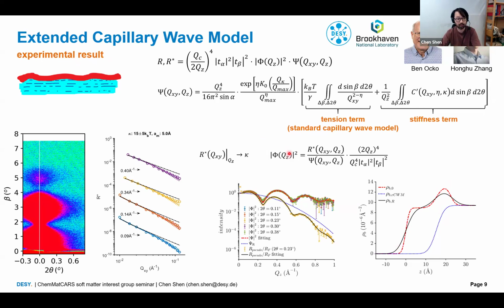And getting this intrinsic structure factor has the advantage that one can now clearly see the hydrocarbon layer and also the phosphorus head group layer from the phospholipid monolayer. So one can really distinguish the two layers much more clearly, and the width of each interface between the slabs directly corresponds to the distribution of the chemical moieties, like this transition from the hydrocarbon region into the phosphorus head group region via the glycerol backbone.